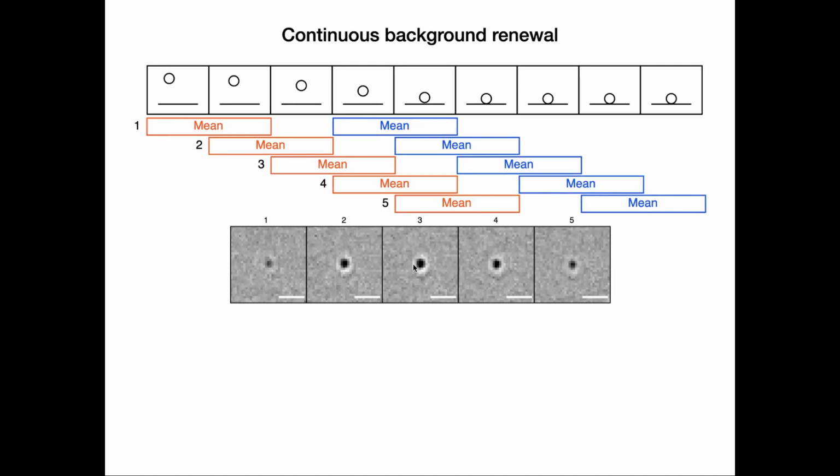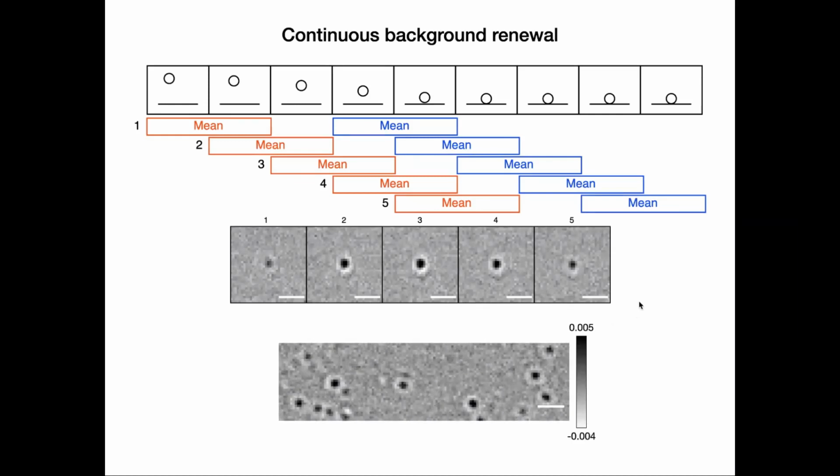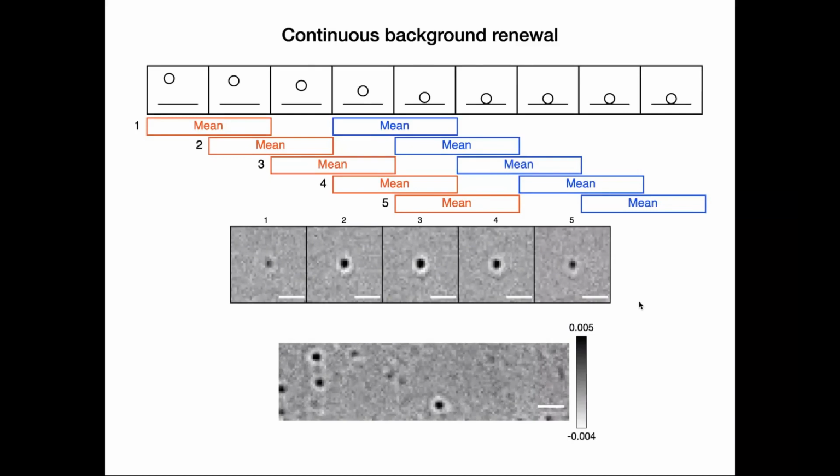It has a peak contrast at the time when all frames contain the particle, but it is not contained in the background frames. And as this whole background removal window slides further through the frames, the particle becomes part of the background and it is removed again. This way we can separate all the landing events of the molecules clearly and determine their contrast.